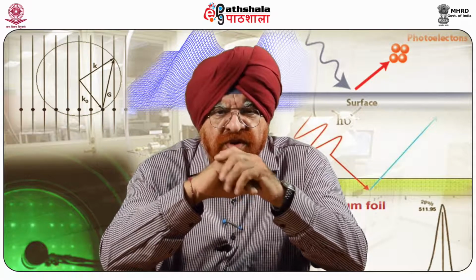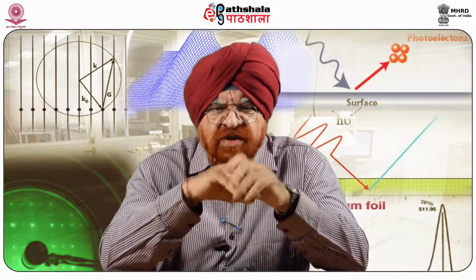In fact, in accordance with the literature, Cho et al. in 2002 and SQUID results, no MFM signal has been observed from both the amorphous and the crystalline manganese-free germanium films.